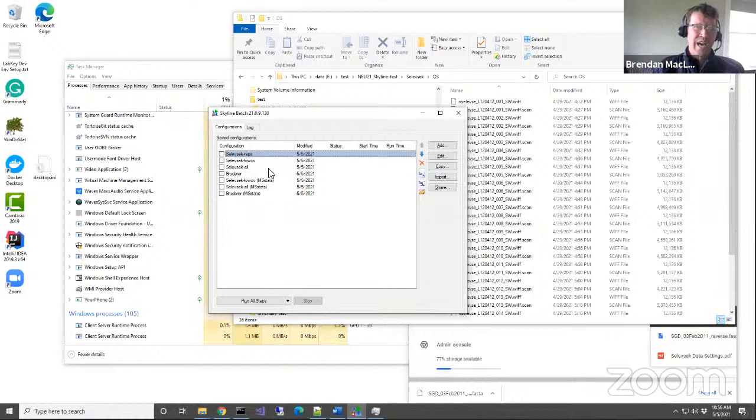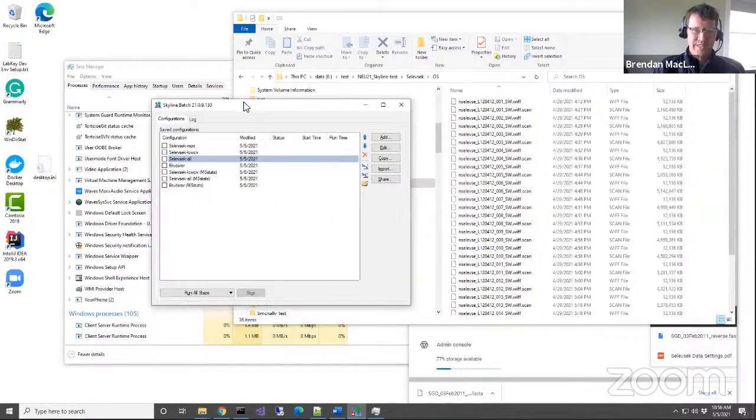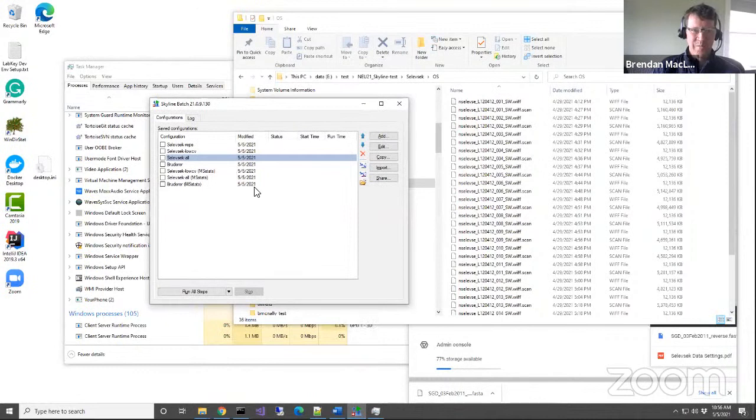So we hear a lot in proteomics, like, oh, if I do something like this low CV experiment, I'm losing all these things that I could be measuring, but you're also losing noise. And so I think we're going to see that you get better quantitative signal out of MS stats in the end, and that was what this was designed to investigate.